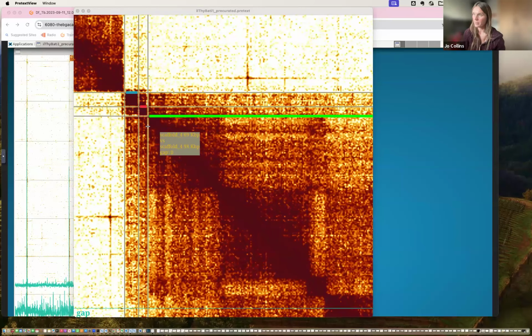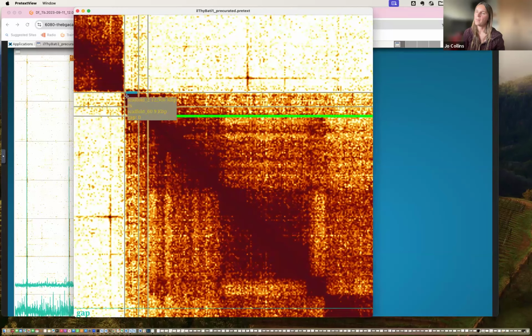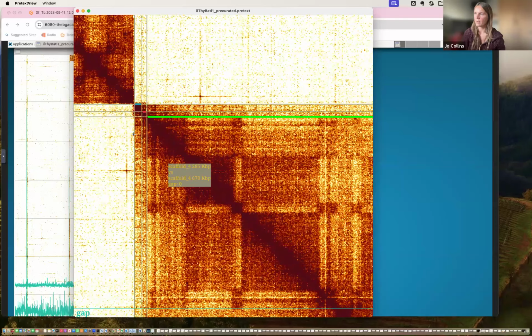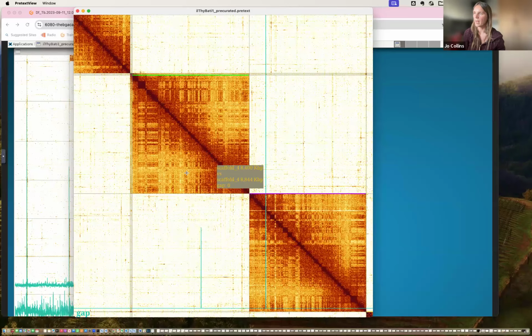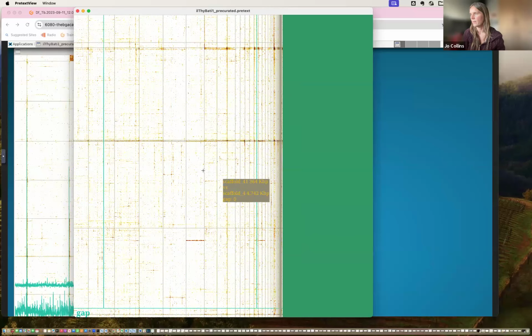So I'll look through here. Now we've got contact through those pieces onto our assembly, onto the rest of the scaffold, sorry. We've looked through that already so that we know that we're happy. I think that was all the pieces that we had. Yeah, so it looks to me like that was everything.